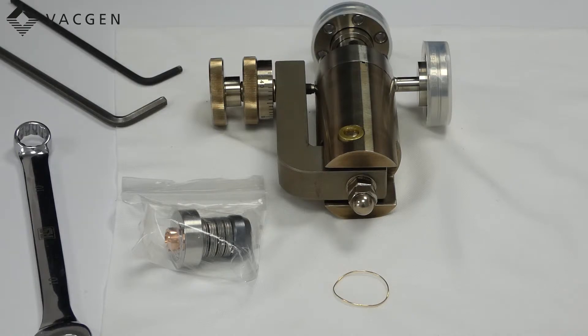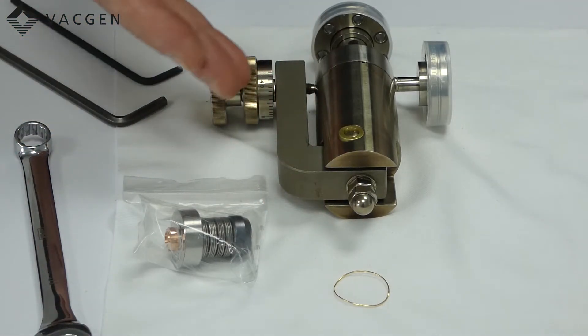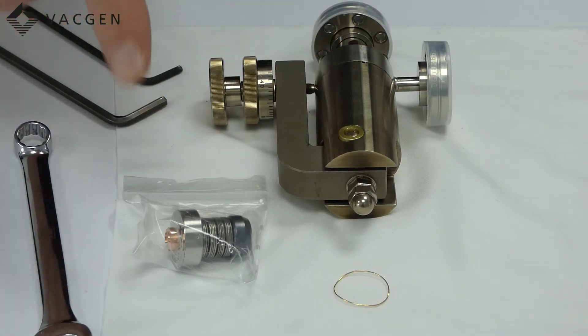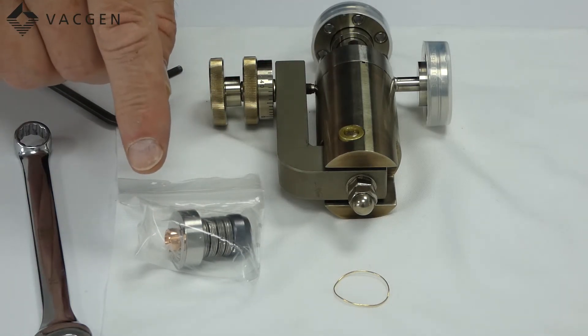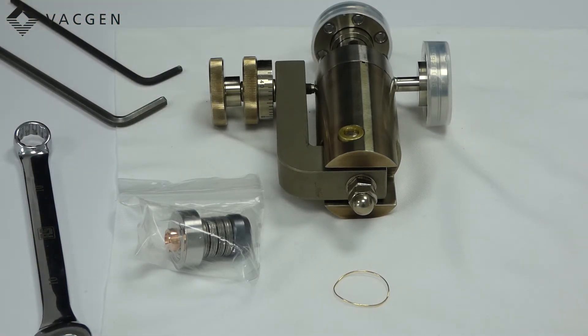If this was the diaphragm kit you were replacing — which is this item here with the gold seal — then you just simply take the old diaphragm assembly out, throw it away and replace it with this. This is already set up so you just drop this in as shown in the previous part of the video.